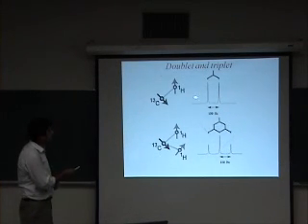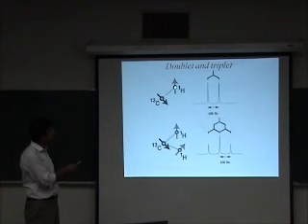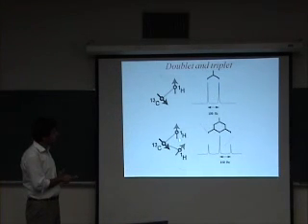So when you have coupling to a single proton, you get a doublet. When you have coupling to two protons, you get a triplet. And this is a spin half nucleus. Spin half की वजह से, एक spin half की वजह से दो में splitting होती है. ठीक है, यहाँ दो spins की वजह से इस तरह का एक triplet pattern बन रहा है.